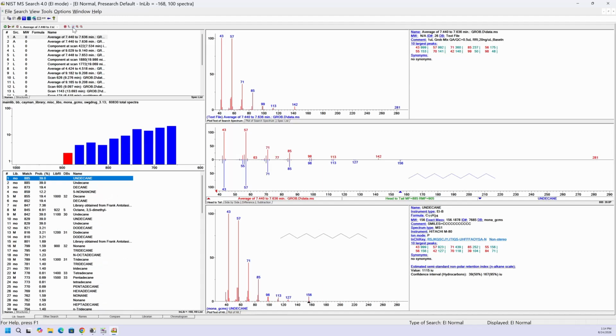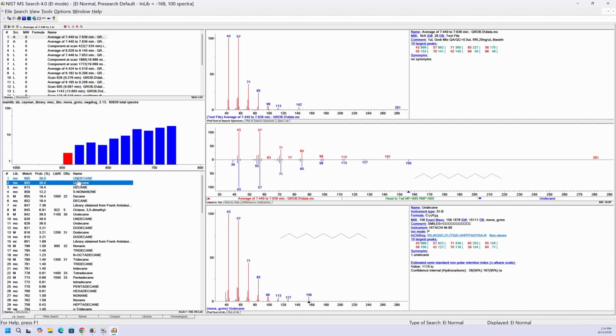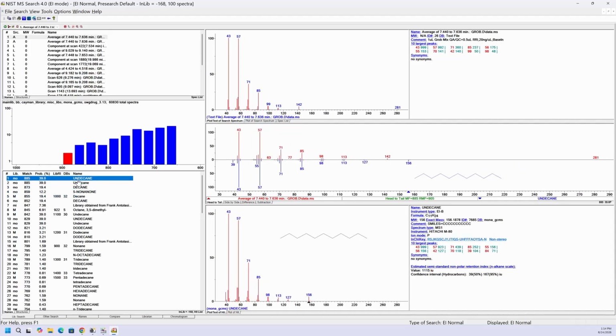I usually keep that off initially because I want to see everything, because some of them will have identities, but they won't have a structure. But if I go to another one that's a good fit, it'll be the same thing with the structure, because you only got this partial library right now. So that's how that works. So pretty much done with that.